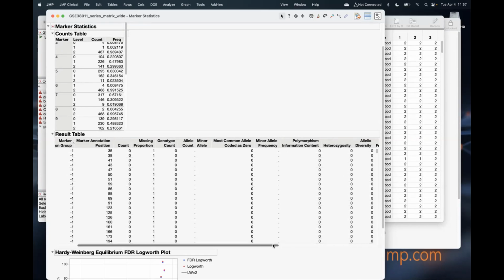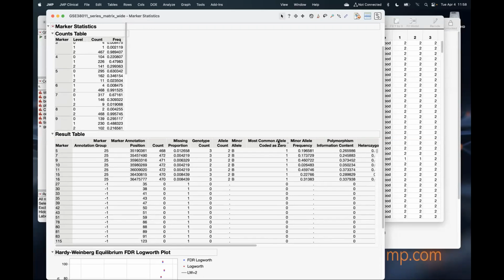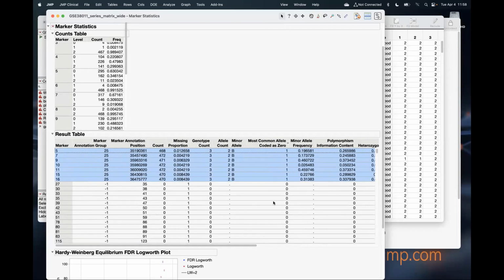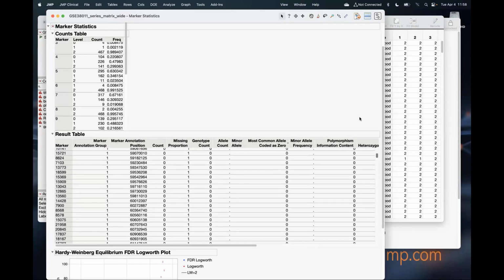So I did that first. So I've got all of that. And here's what I want to do. Most commonly, what I wanted to point out is most commonly coded as 0. If it was not, we would see things like this, right? For example, and this is what tells me I have done something horribly wrong here, because my annotation is off somehow.